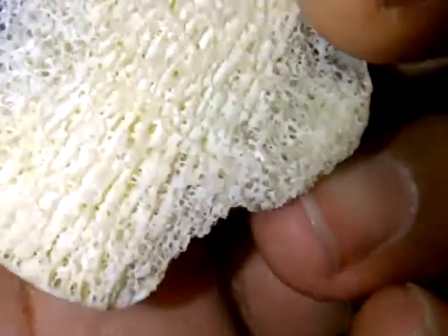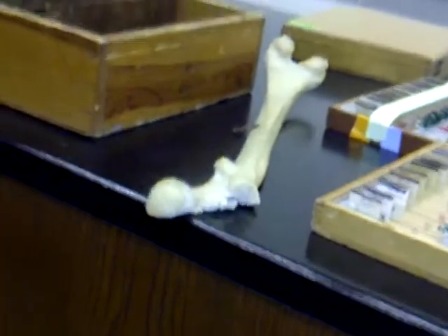I think this is a good motor end organ? Oh, okay. Okay, yeah. Alicia's got the prize. Let's see, what would you like to do? There you go. That was a stupid question, wasn't it? How about a nice, clean, unused piece of lens paper?